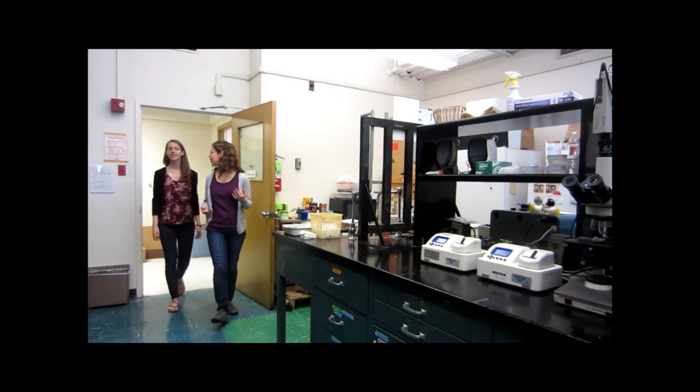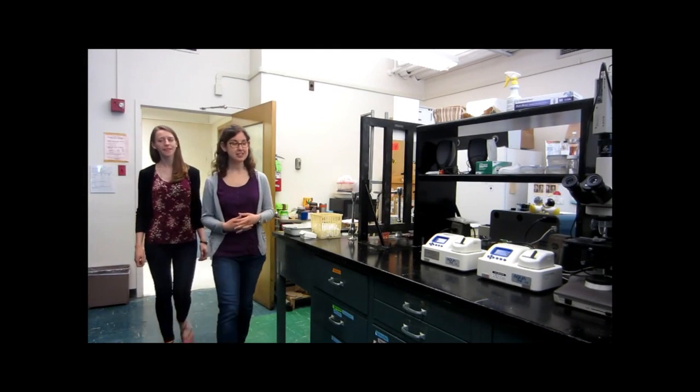Spending most of your time doing research. As you can see here, we have two water activity meters. Water activity? I remember learning about that. That's the thing that tells you the amount of water in food, right?